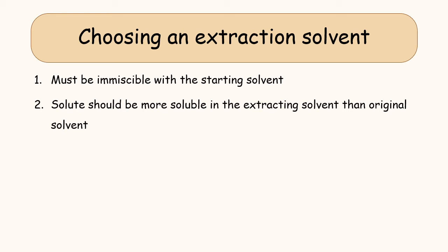Otherwise, it's not really worth your while doing the extraction. So the thing that you want to extract needs to be more soluble in the solvent you're doing the extraction with.